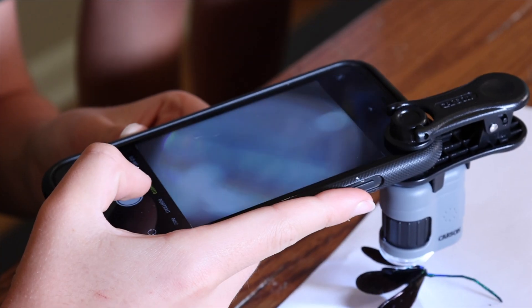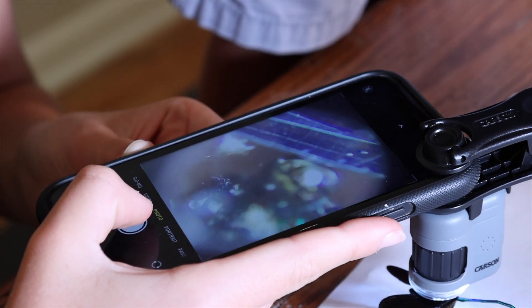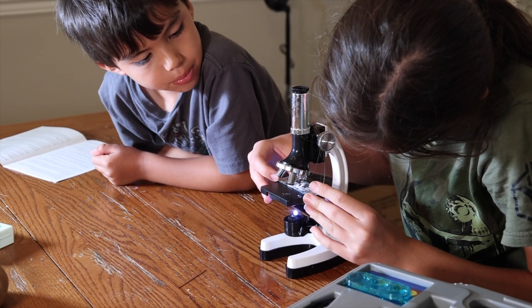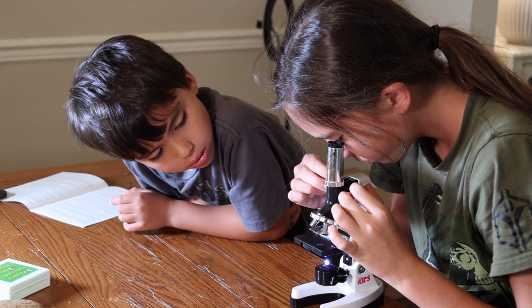So in conclusion, which one is better? It's complicated. If you're thinking about purchasing a microscope as an introduction to microscopy for younger kids and don't know exactly what you plan on magnifying, I would start with the Carson Micro Mini — you'll have a great time taking it out in the yard or around the house, and you can magnify anything. We typically magnify bugs and insects we find outside, which is always pretty interesting. That being said, if your kids are a little older and ready for the experience of making slides and preparing mounts, then the Amscope is a pretty good way to start.